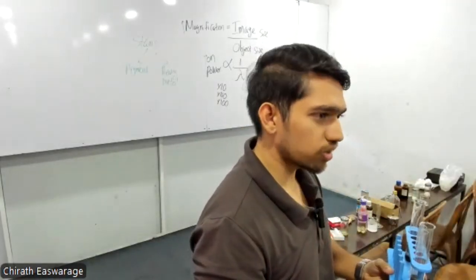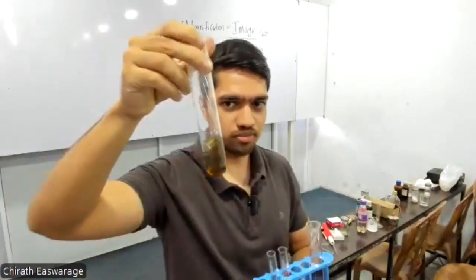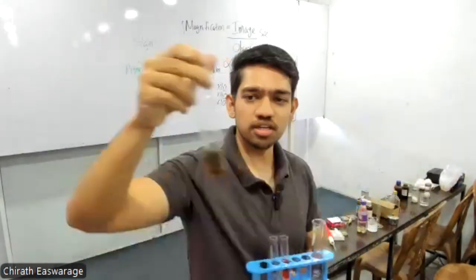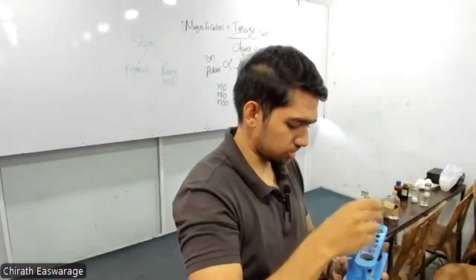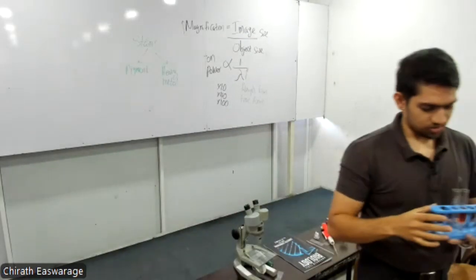Starch or biuret? Biuret. Egg white, what was the color supposed to be? With time, this solution reacts with oxygen, and because it has copper, it changes into some weird colors. What was the proper color that we observed? Purple color we observed. Right? Then what was next?